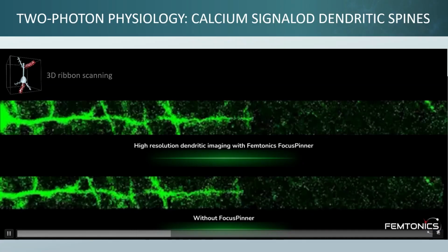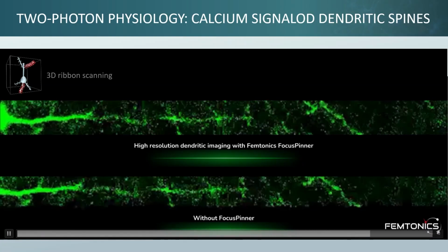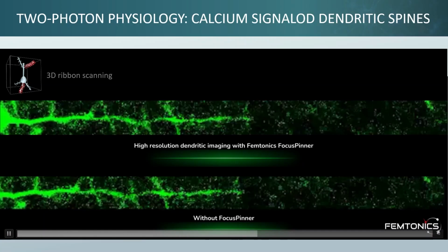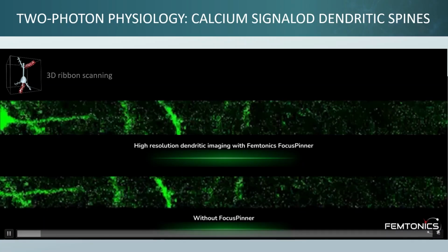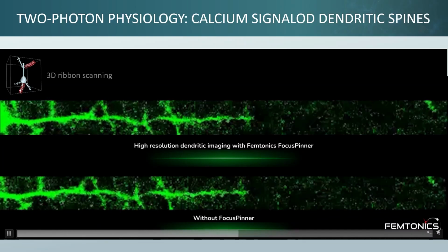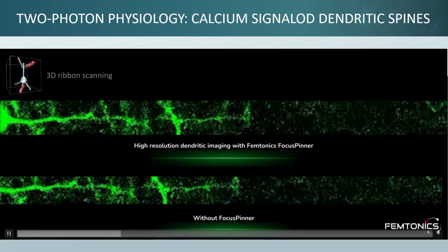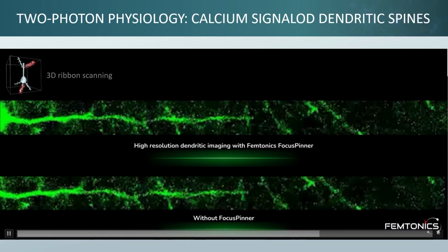Real-time motion correction can be crucial in the case of dendritic measurements as well, where a narrow ribbon is selected as an ROI. This movie shows a recorded ribbon scan as long as 20 minutes, which was used to elicit signal from dendritic spines. The compensated motion along the X, Y, and Z axes can be stored in the measurement file in 3 curves, so the corrected movement can be analyzed without finding any artifact in the signal extracted from somata or dendrites labeled with calcium or voltage-sensitive dyes.